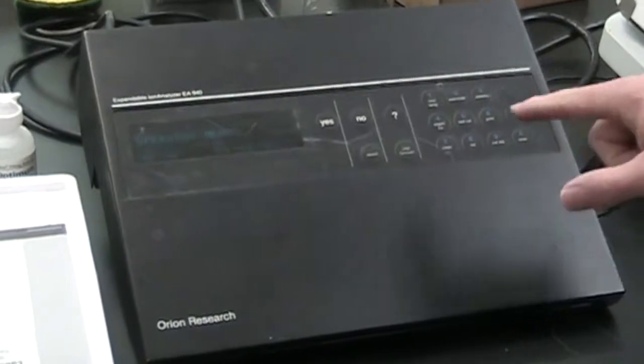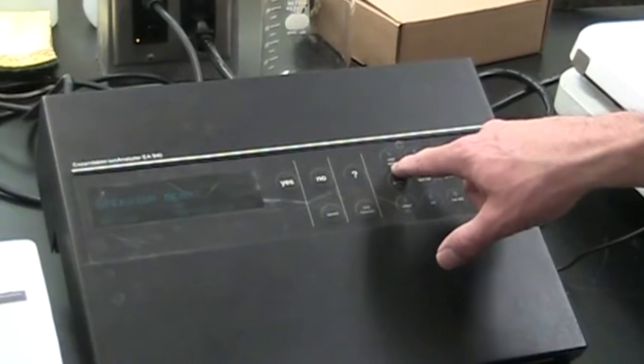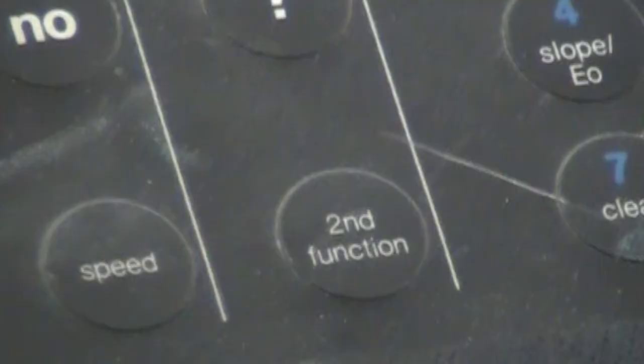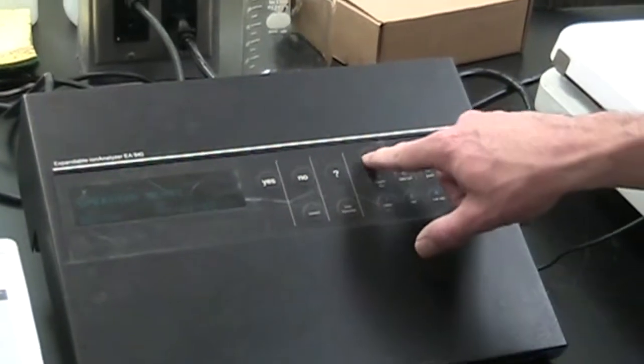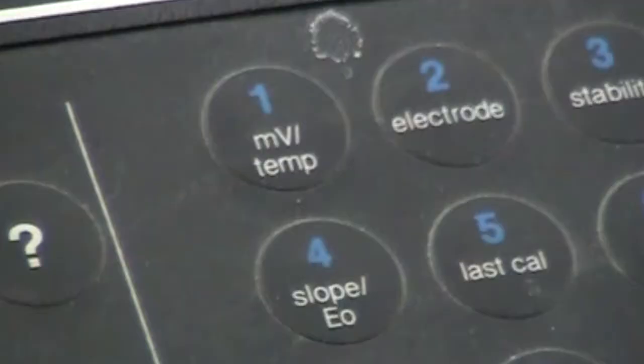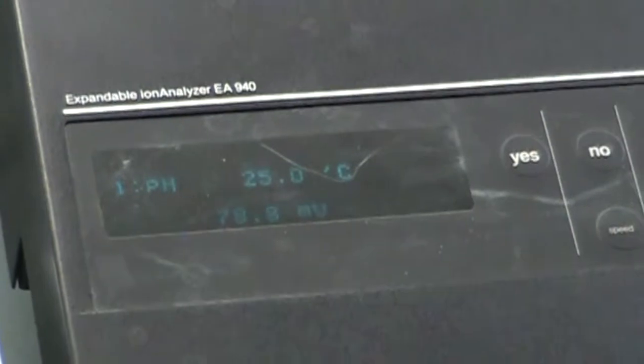All we're going to do is switch to millivolt. You see millivolt temperature is the white writing on the number one button, and white is the second function. So you're simply going to press second function, and then the one or the millivolt temp, and we get a reading in millivolts. You can ignore the fact that it says pH. The millivolts is going to be the data.